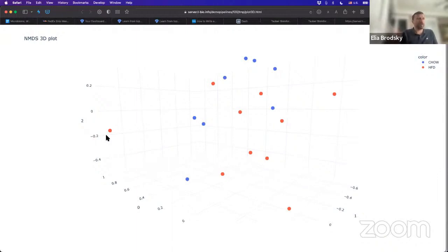This analysis is going to be iterative, which means that you will start somewhere, perform some standard tasks, and then start asking questions. What do I see? And what does it mean? And if I understand what it means, what are the next steps I should take to make sure that I'm getting something that I understand, that makes sense, but is also reproducible and could tell me something about the biology that I'm trying to study? So this is a very brief example. Again, we will go into much more detail throughout the program, but it illustrates the essence of the bioinformatics steps that you would have to go through and understand to be able to work with such microbiome data.